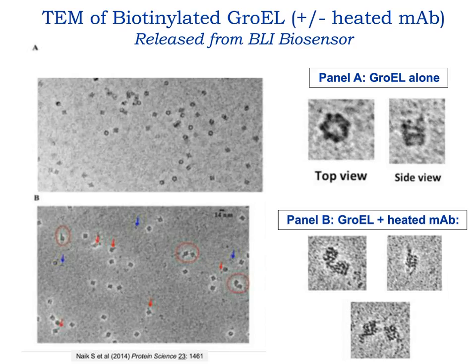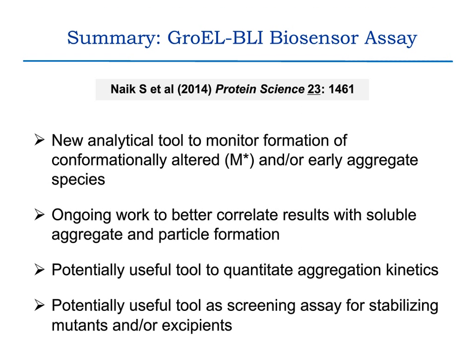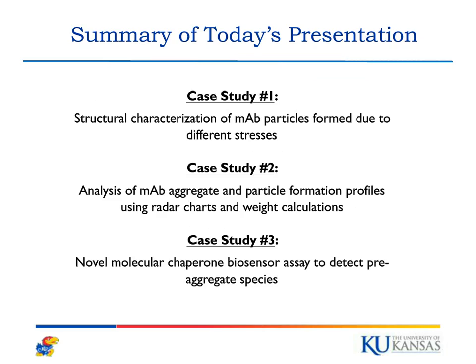So for a summary of this work, we're really excited about the use of GroEL as a potential new analytical tool to monitor these early steps of aggregation. And we're also trying to better understand aggregation pathways and kinetics using the GroEL system. So to summarize, I presented three case studies, recent work from our lab.